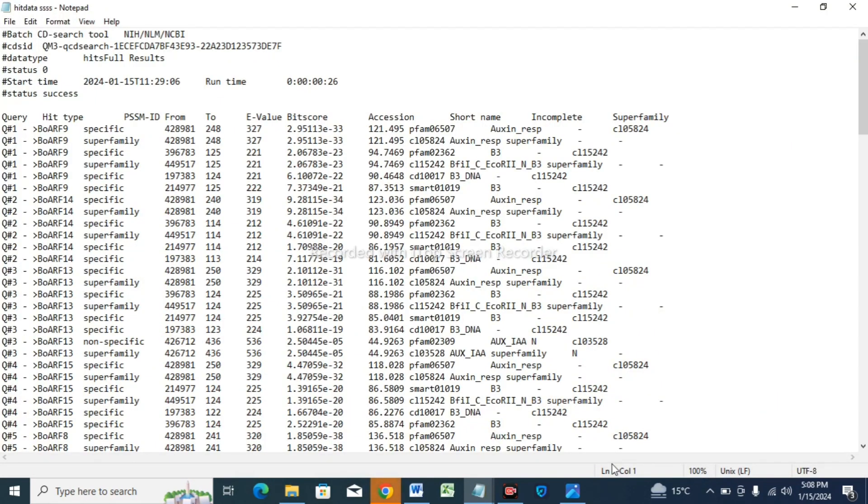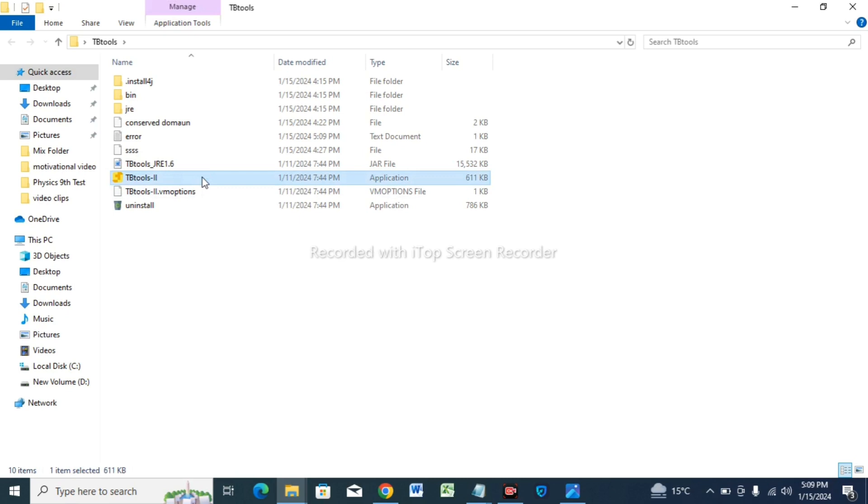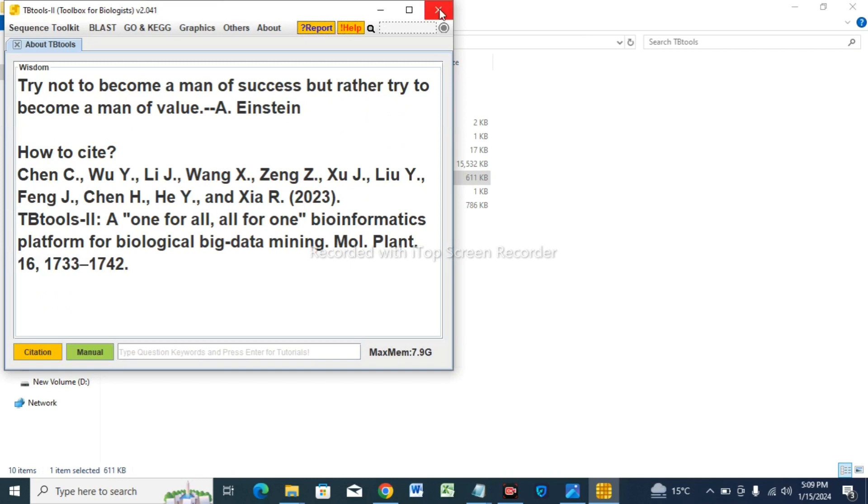This is our heat data file, so save it in your application. Now open the TB tools, tap on this option. The application is opening now.